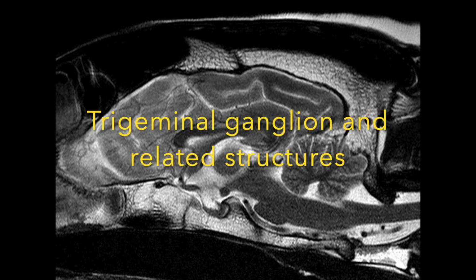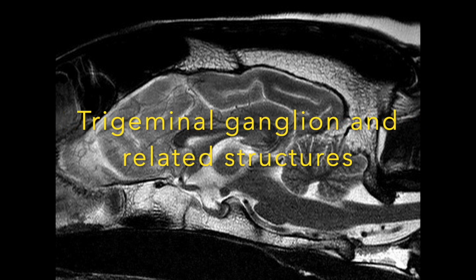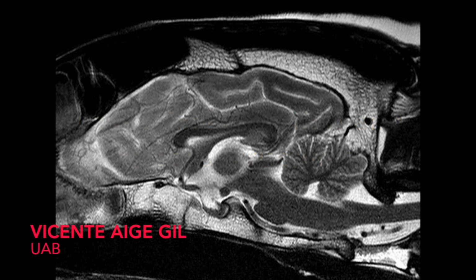This is the second part of the trigeminal ganglion video. We will examine the ganglion and related structures through dissections of transverse sections.